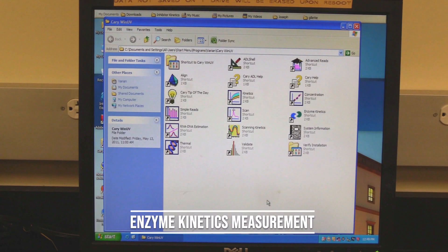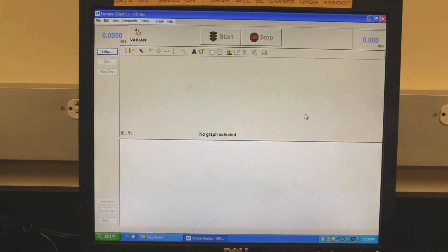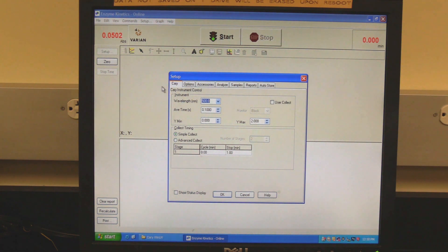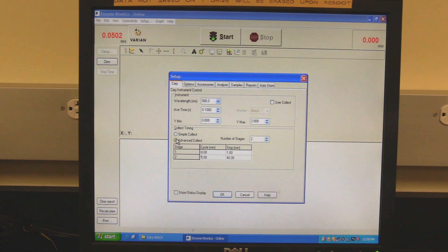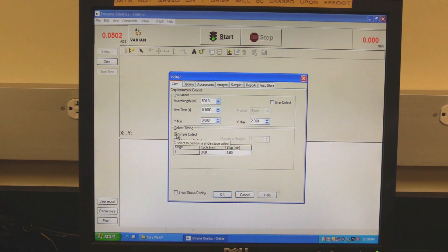Enzyme kinetics measurement: in the Cary Win UV folder, double-click on the enzyme kinetics icon. Wait for the software to open and initialize — the instrument will be finished initializing when the absorbance reading turns red. Click on Setup to set measurement parameters. Setup should open to the Cary tab. In the instrument section, set the wavelength and average time. In Collect Timing, select simple or advanced collect — use simple if there is only one stage, use advanced if there are multiple stages. In the Cycle column, set the cycle duration; in the Stop column, set the end time of the reaction stage.